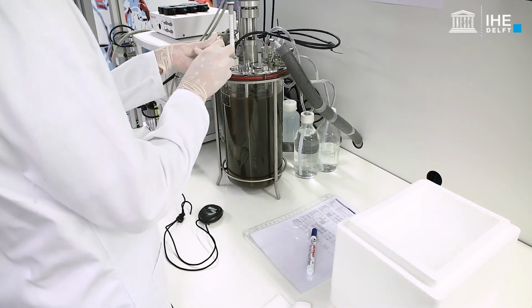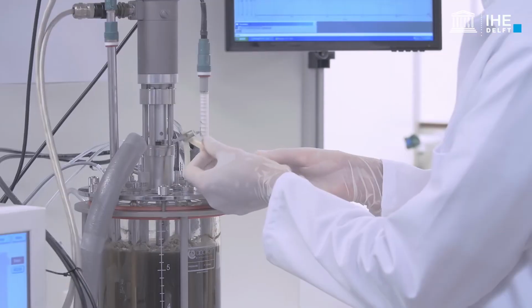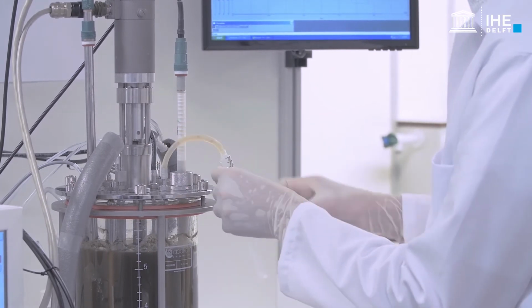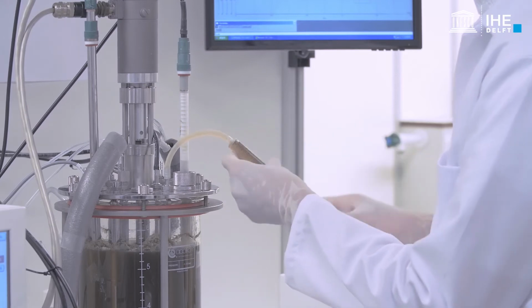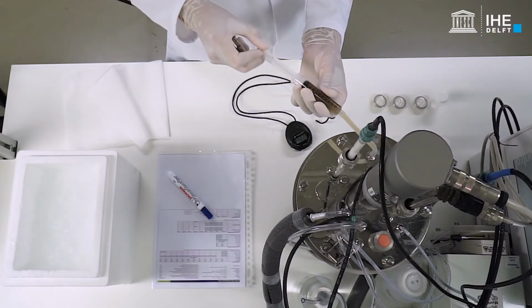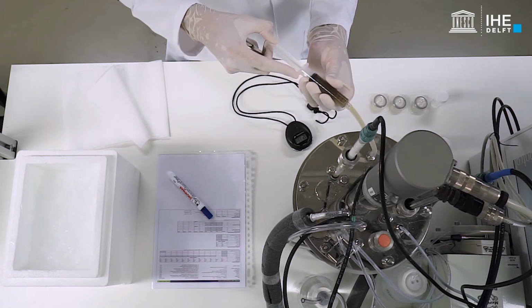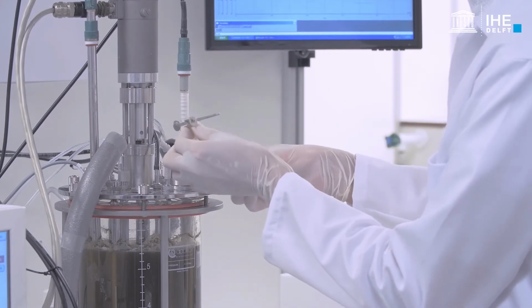The preliminary samples will be used to determine the initial concentrations of the parameters of interest. Tightly connect the syringe, avoiding the intrusion of oxygen, and push and pull at least 5 times until a homogeneous and representative sample volume is collected. Close the sampling port with a clip to avoid spillages.